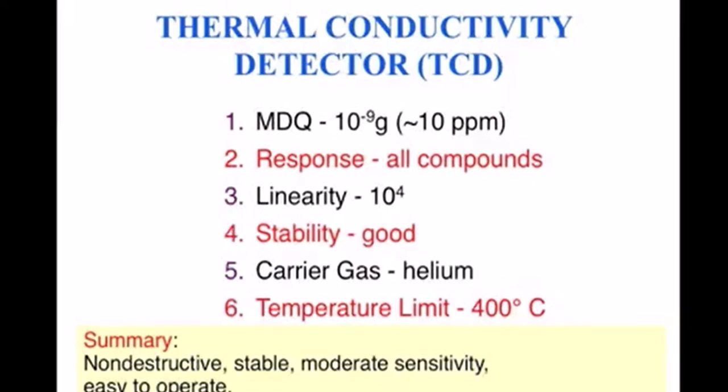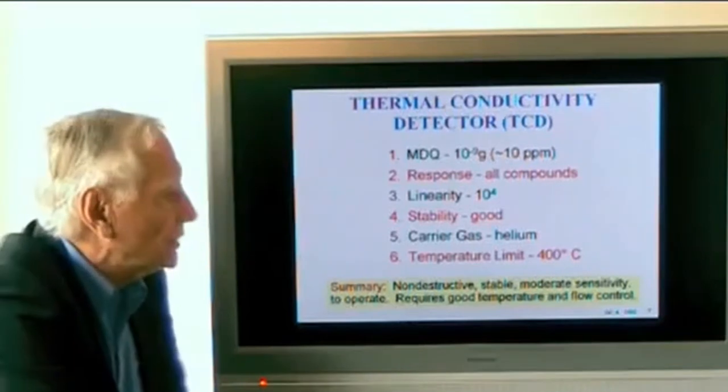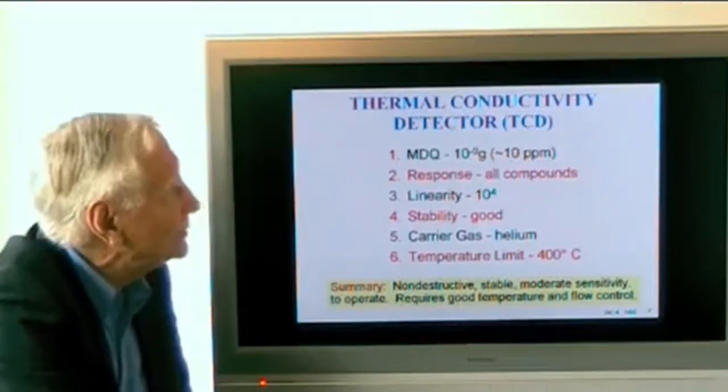Thus you could couple or connect another detector after the thermal conductivity. Moderate sensitivity, easy to operate, requires good temperature and flow control, which are easily available with modern day instrumentation.